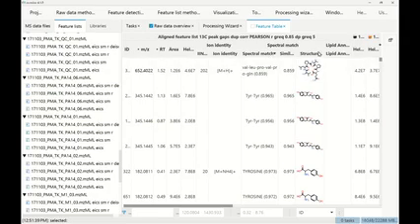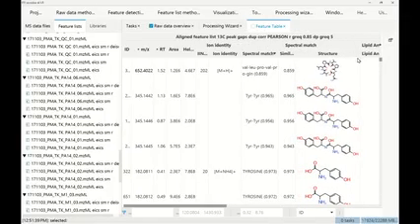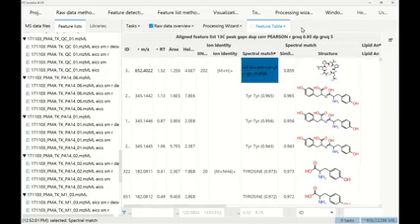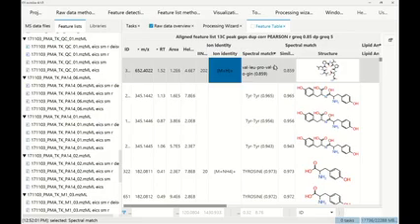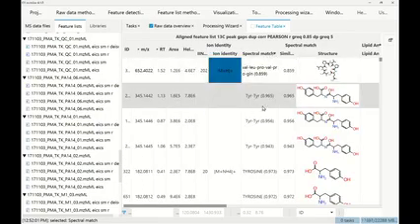Yeah, so through spectral library matching, we already have some annotations with structures here, and those come from the MONA LCMS-MS positive library, but you can also use your own, and so on. And here's the ion identity, which points to the ion identity that we identified for this row. In the table, you can always sort, for example, by spectral library matches.